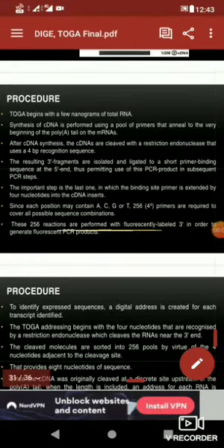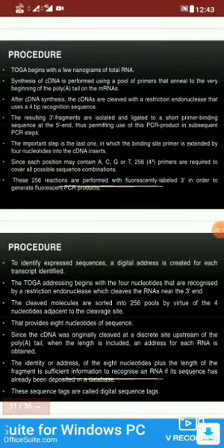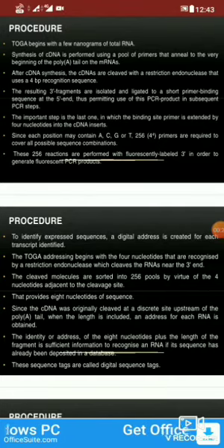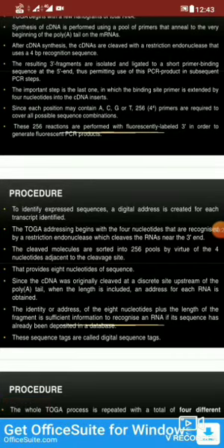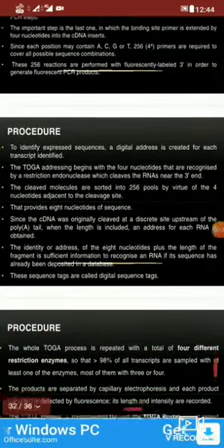Okay, so we stopped with the important step last time, where we understood that the primer binding will have an extension of 4 nucleotides, which can have 256 different combinations. Why do we require 256? Because we do not know the sequence of the mRNA that we have isolated. So if we use all the 256, there is a possibility that at least one will 100% bind to the mRNA, and extension in the PCR extension step will be carried out and your PCR product will be produced.